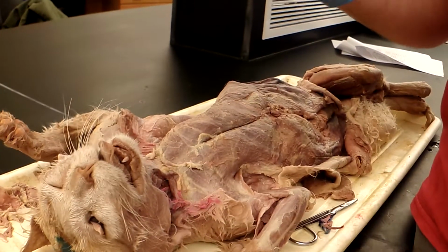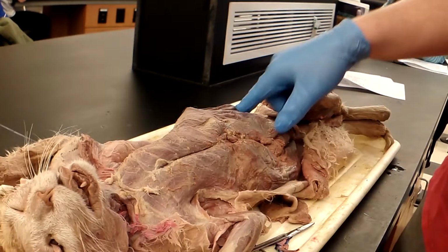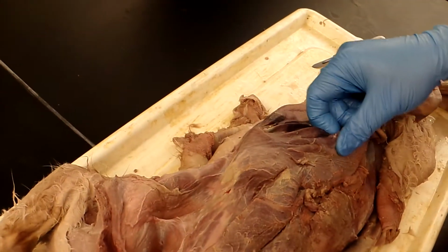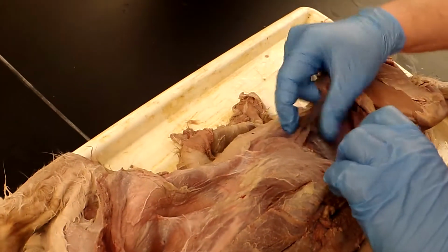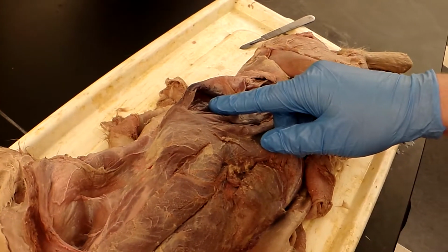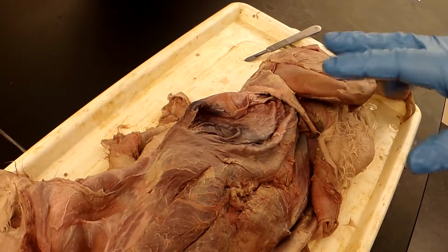Moving on to the abdominal or hypaxial musculature, the external oblique is located down by the legs. Located down here. Actually, we cut that out, didn't we? Should probably look at that, but yeah. The external oblique: the origin is the lumbodorsal fascia and posterior ribs. The insertion is at the linea alba, and the function is that it compresses the abdomen.